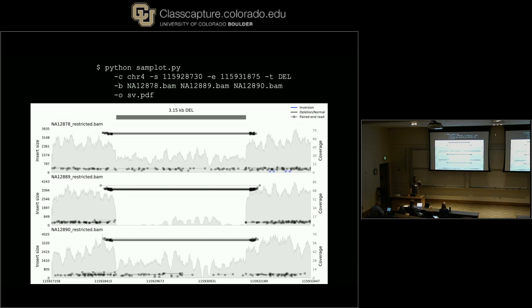So is she heterozygous or homozygous, the top individual? Heterozygous, right? So who gave her the copy that had the deletion? 8, 9, right? 8, 9 is homozygous, so 8, 9 has 2 bad copies. 9, 0 has 1 bad copy, 1 good copy. She's heterozygous, so clearly her mother gave her the copy without the deletion, and her father gave her the copy with the deletion because he had no choice, right?